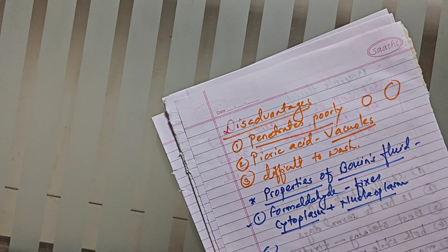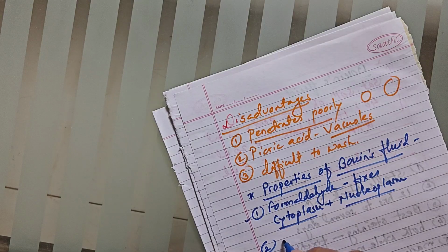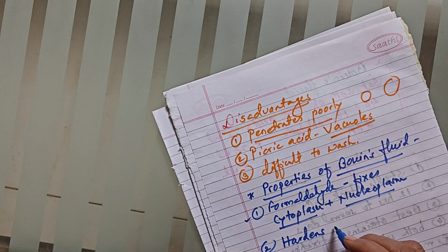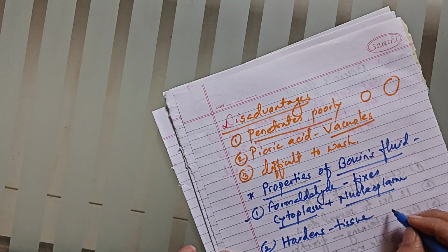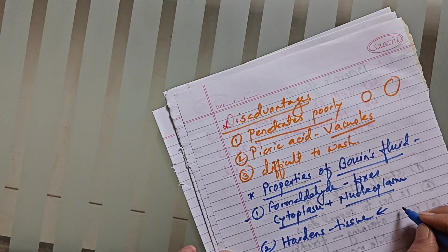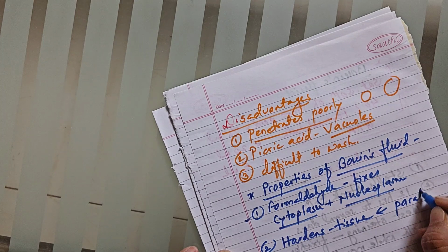But formaldehyde hardens the tissue, so paraffin cannot enter easily. It prevents the entry of paraffin.